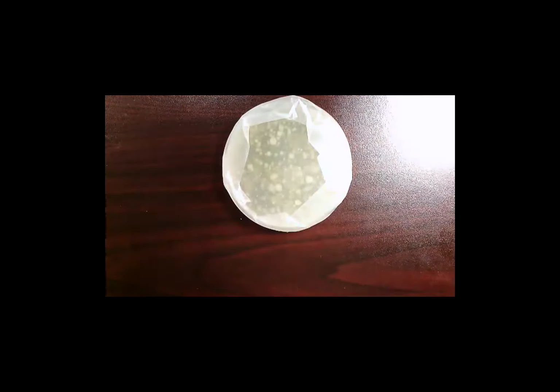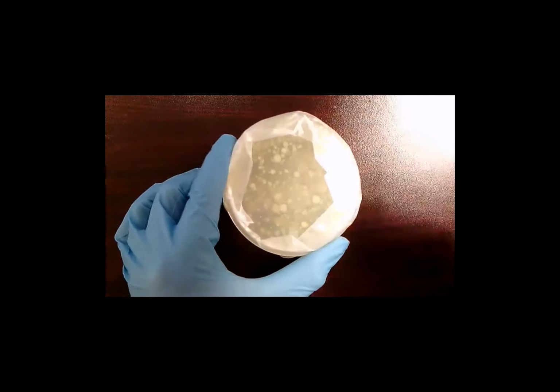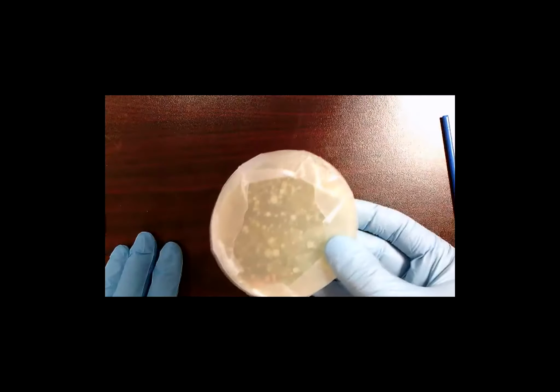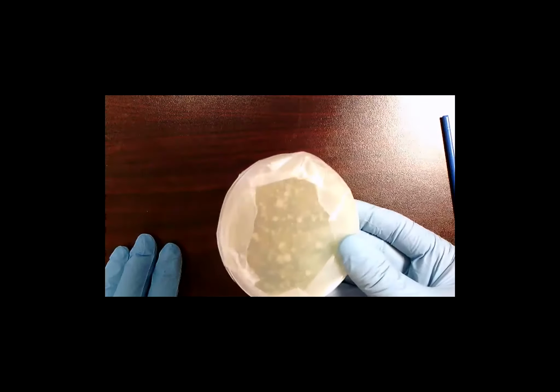So if I switch over to the nutrient agar, there's a lot of colonies. Now the students are going to be able to pick up the dishes. They're going to be taped with parafilm, which, let's see, is this stuff right here. And if you don't want to purchase parafilm, because it is kind of expensive, you can just use clear tape as well. But when you're working with your class, you do want to make sure you tape them up so that the students can't get into them and risk getting exposed to the bacteria.